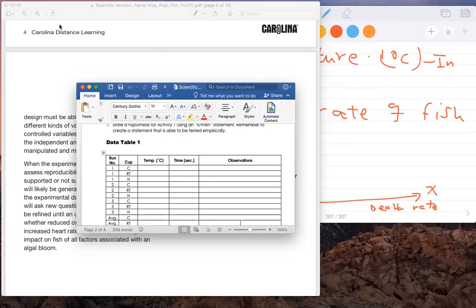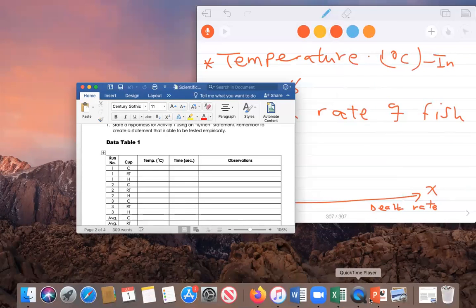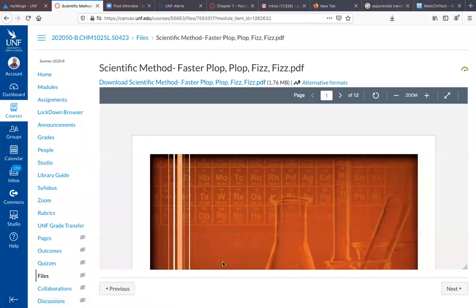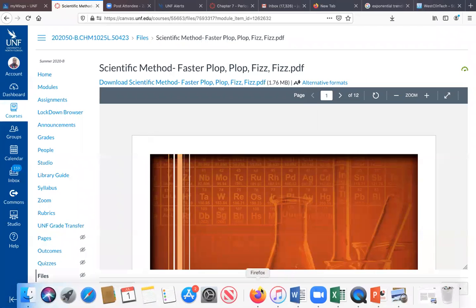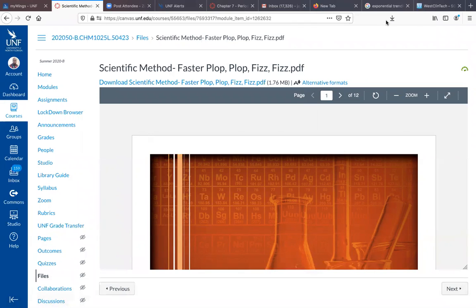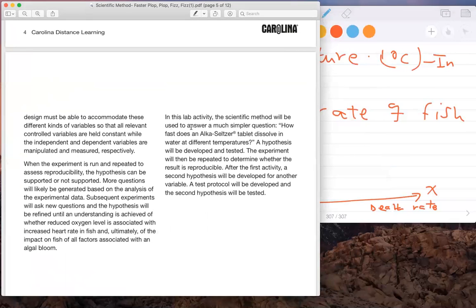So that is what they stand for, different temperatures, right here. So three. When we say different, know that there are three what? There are three water baths. You have to do that.